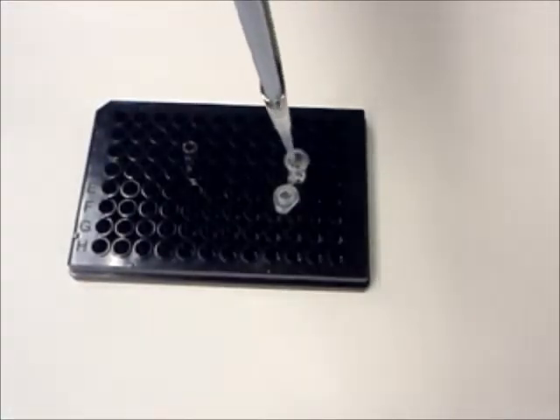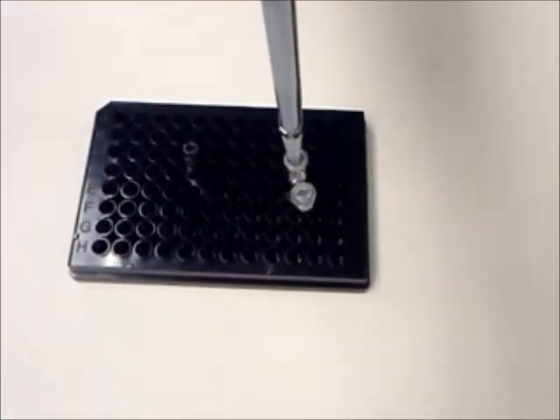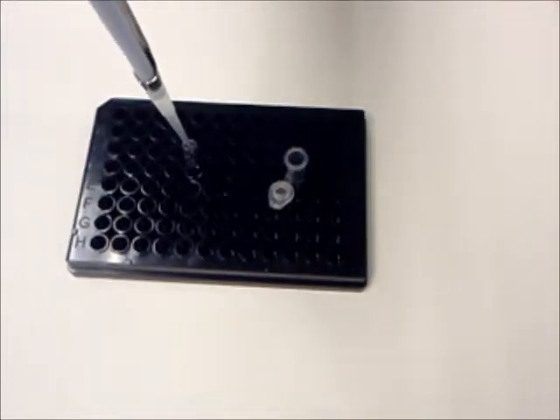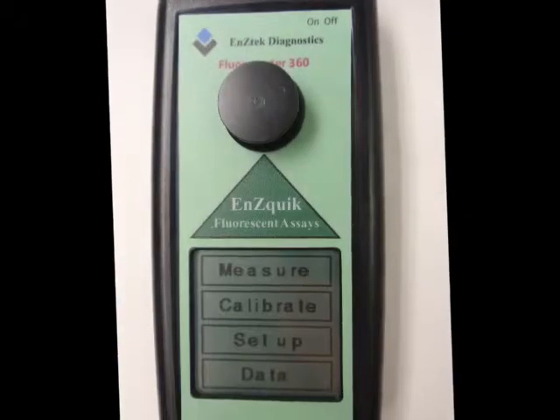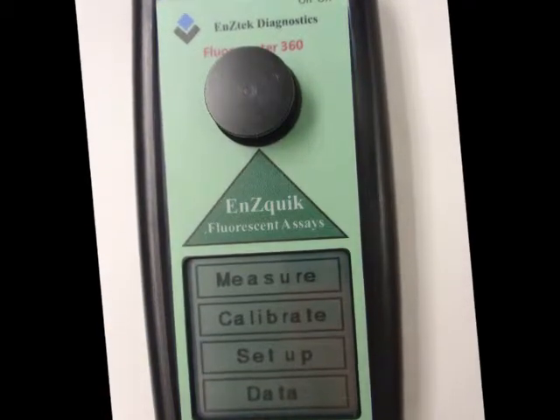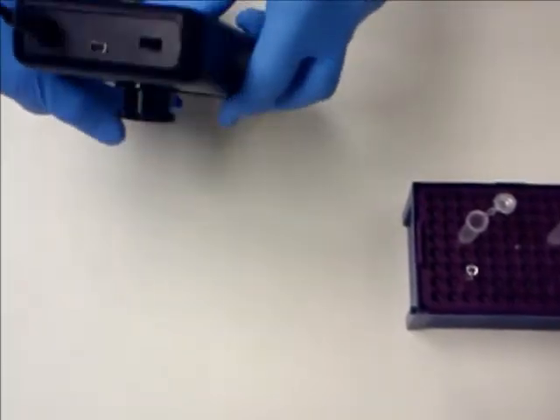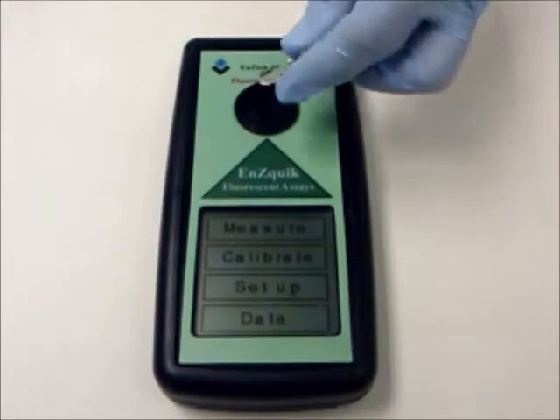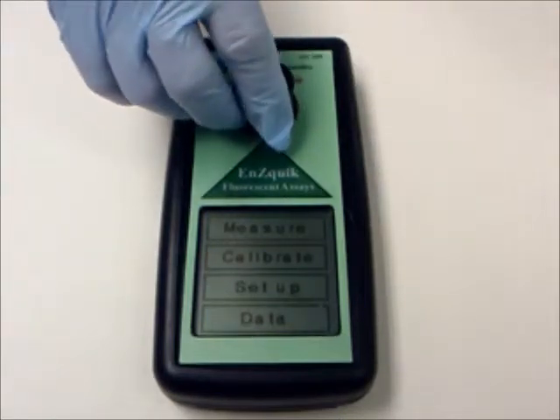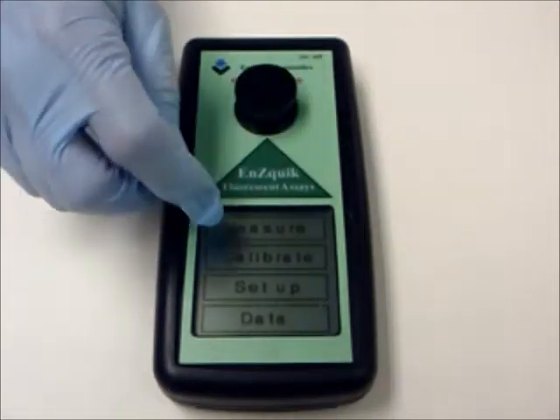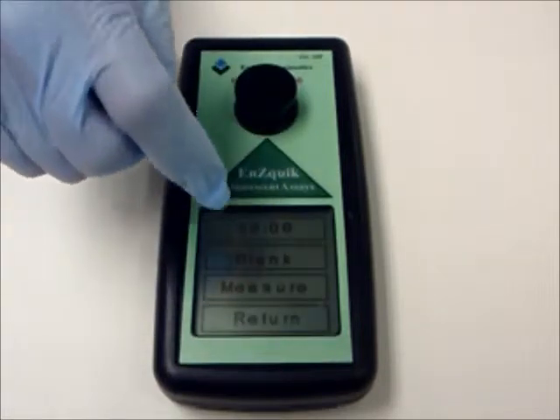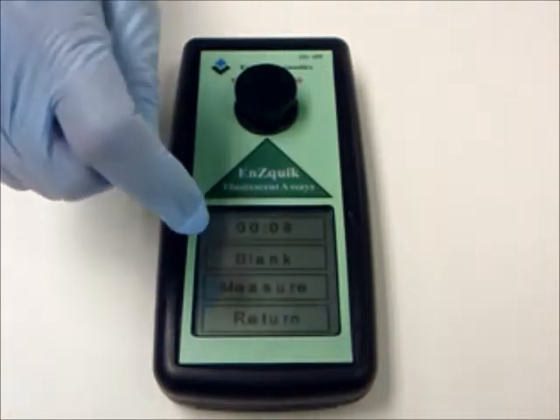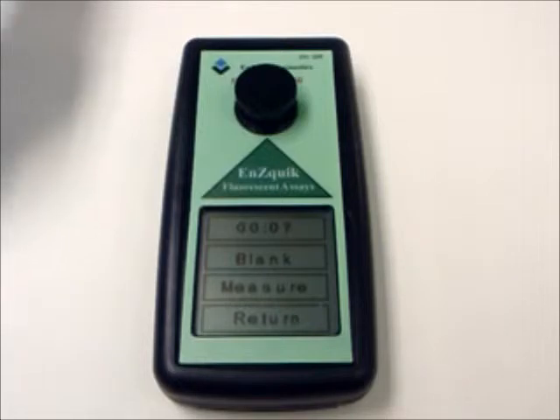Using a disposable pipette or pipette tip, pipette 175 microliters of the solution from the plastic mixing vial into the small glass testing tube. For this particular assay, we are using the low wavelength fluorometer. Be sure your fluorometer has been turned on. Place the small glass testing tube into the fluorometer test chamber and secure the fluorometer cap onto the test chamber. Push the measure button on the touch screen, then push the button labeled blank on the touch screen. The timer will start counting seconds. This blank function zeroes out background fluorescence.